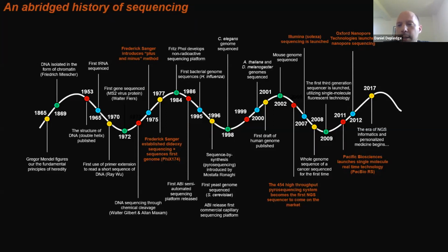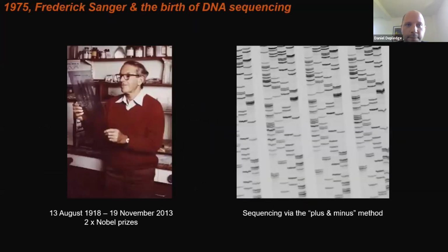More recently, a couple of companies, PacBio Sciences and Oxford Nanopore, launched very new technologies aimed at performing what's called long read sequencing. We'll talk about the difference in short and long read sequencing later on. But really, the main message to take from this is it's really been the last 10 to 15 years that the sequencing world has leapt forward, and that we now have this incredible wealth of technology with which we can ask probably more questions than we can imagine even at present. And that is a hugely exciting place to be.